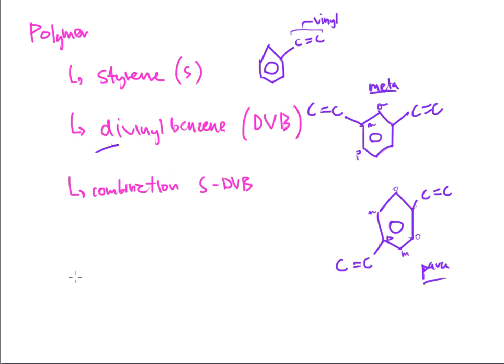These are great. They're organic, so they're going to actually withstand very high pH levels. You know, benzene is pretty stable on its own. Benzene is delocalized. It's not going to be reactive that much. I mean, it's kind of a big boy in the chemistry world, and it can take care of its own, and it doesn't need to live with mom and dad anymore and mooch off of free room and board and nice meals prepped in the mornings. Benzene can take care of himself. And because of that, it can withstand quite a bit. And one of those things that it can withstand is high pH values. So this is going to actually be good for it. It can do this without a problem.